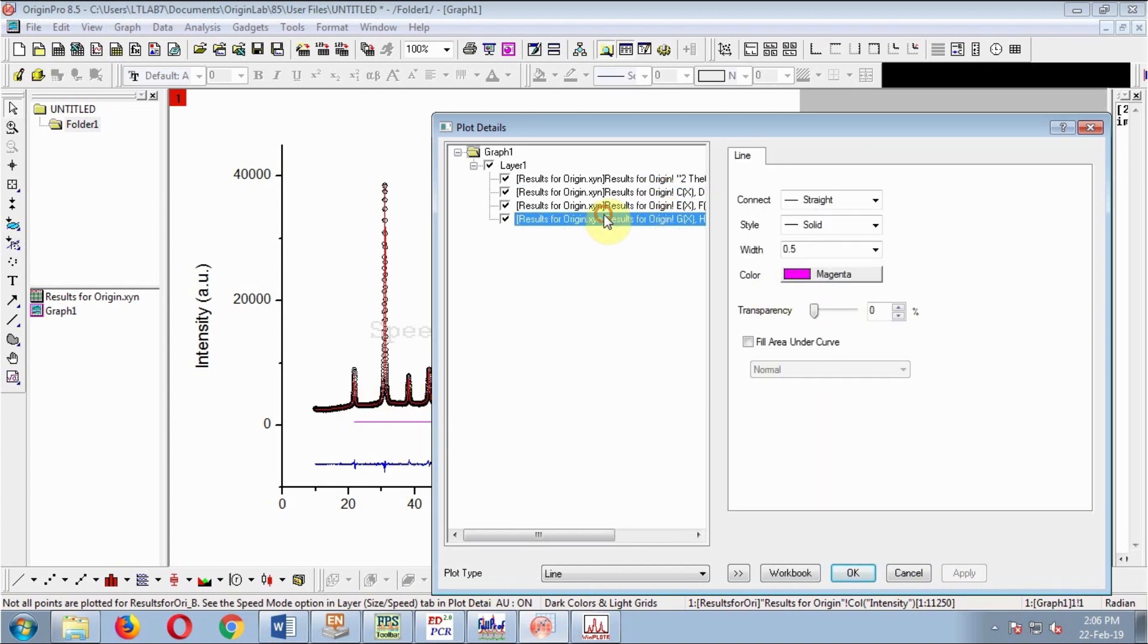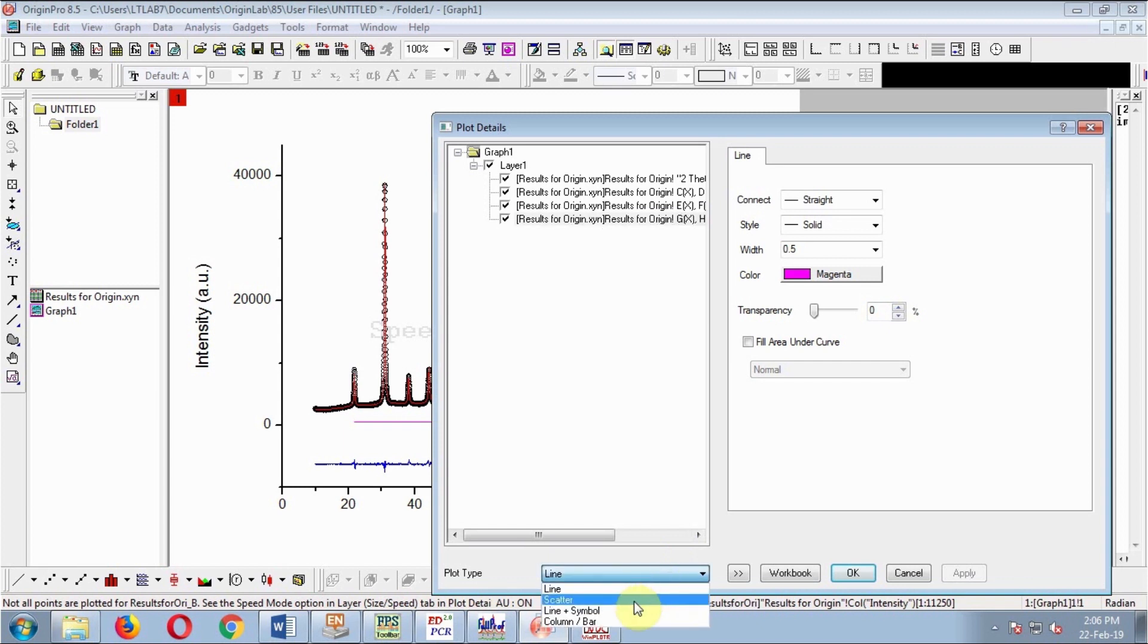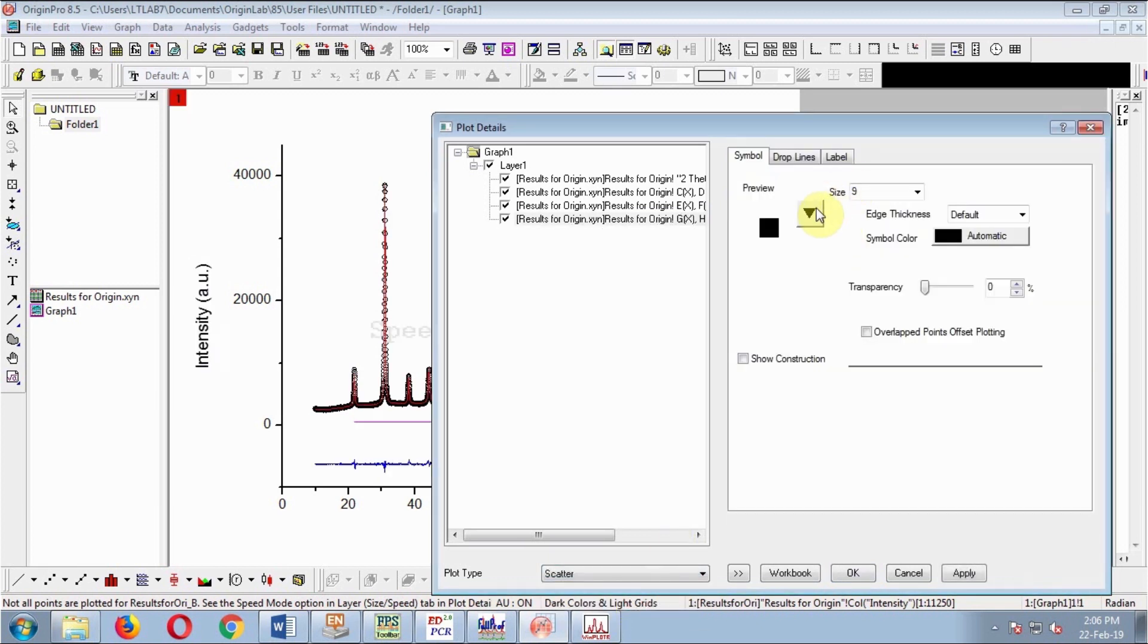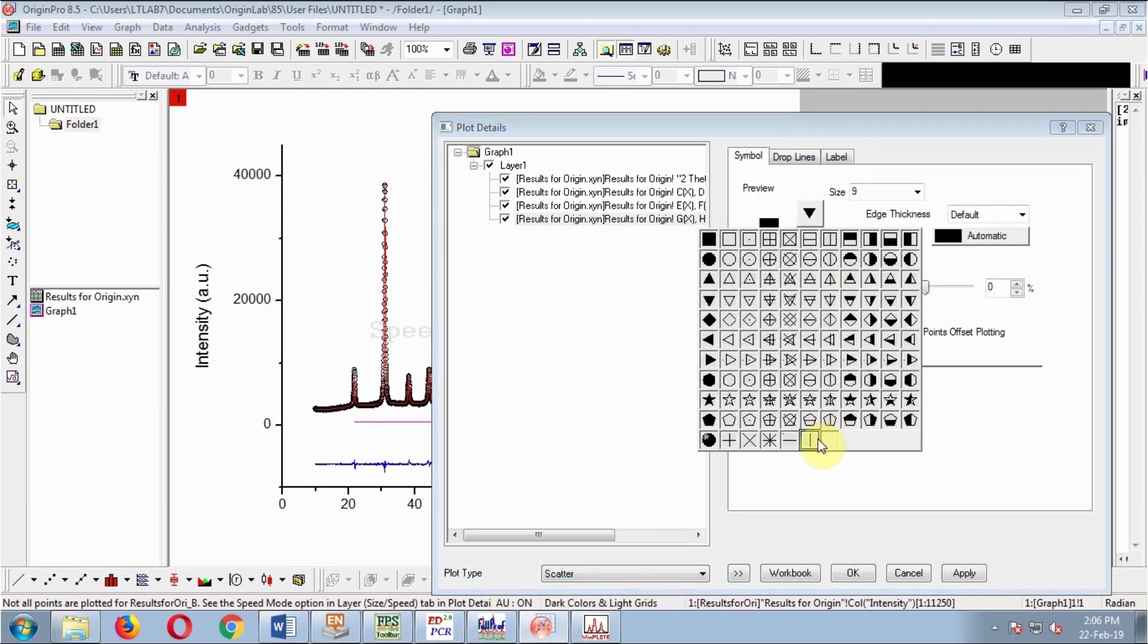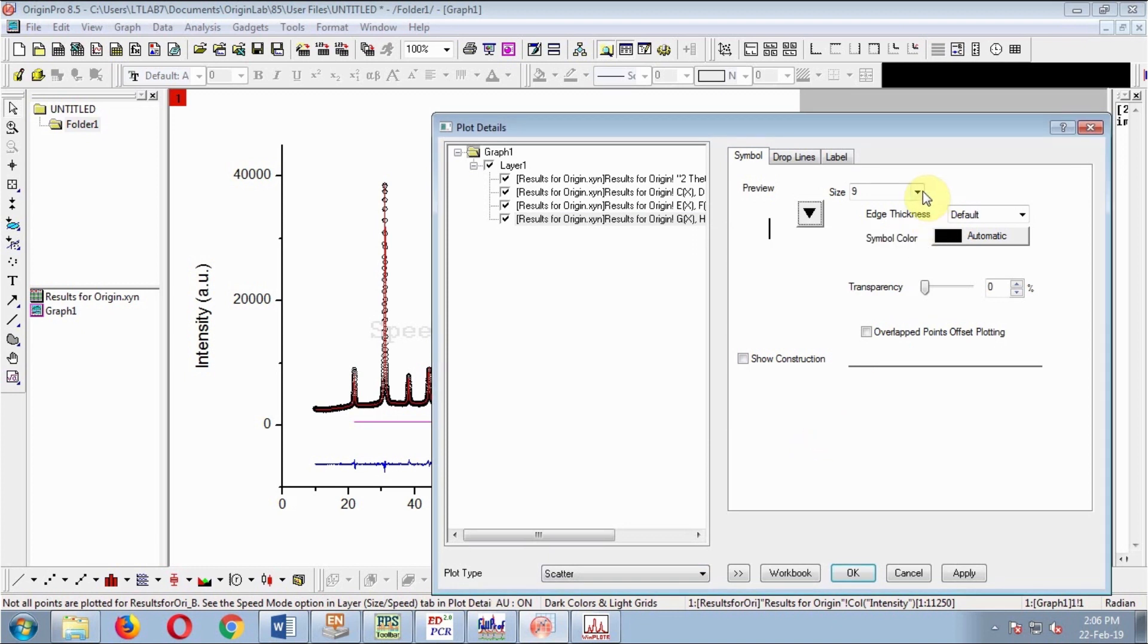The fourth one is for Bragg reflections. It should not be a line. Change it to scatter and use vertical line as the symbol. Adjust the width and size.